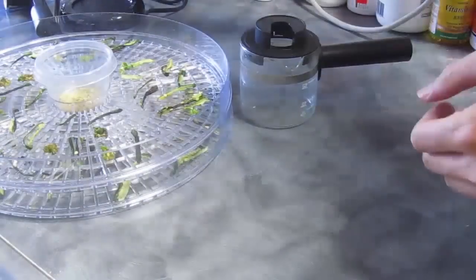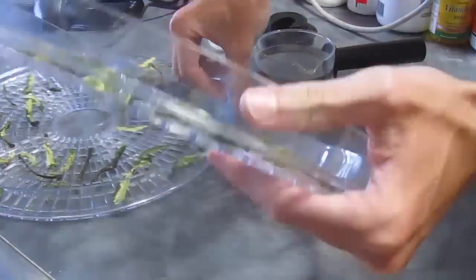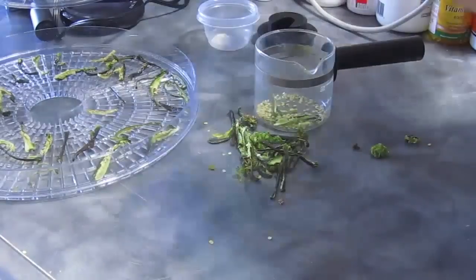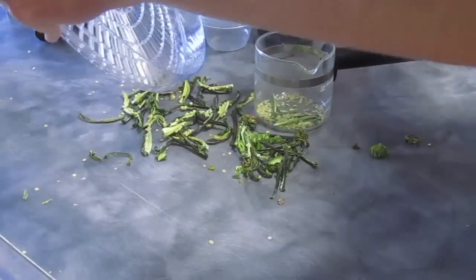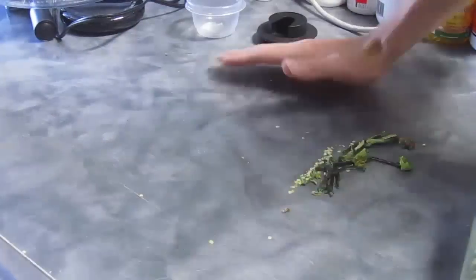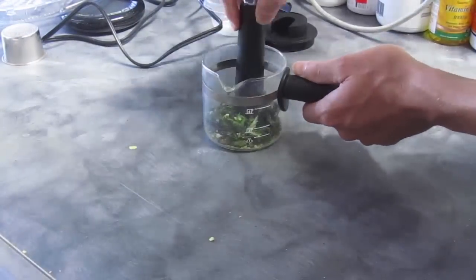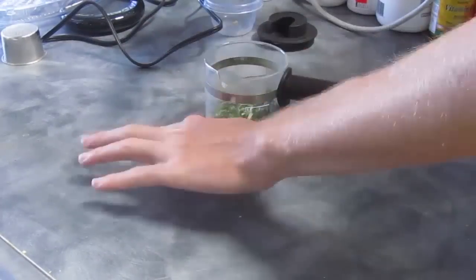So what I did next is crunched them up. Oh man, this makes me cough just thinking about it. I should have worn a dust mask, because even though you couldn't see any dust, the vapors were real pungent.